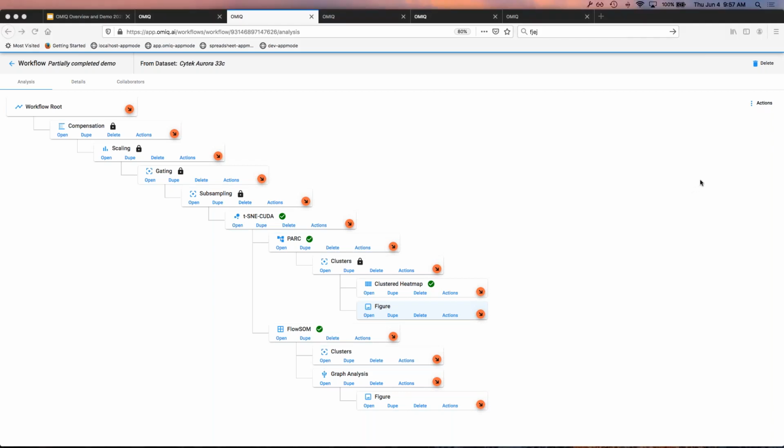Kind of related to the t-SNE CUDA is, can you comment on the reproducibility between runs for that algorithm? So this is either an advanced question or a basic question. t-SNE CUDA is interesting because this algorithm actually does not have a reproducible seed. We've looked into this. We're thinking about trying some stuff out to change that. But that's actually unique to t-SNE CUDA on this platform for the most part.